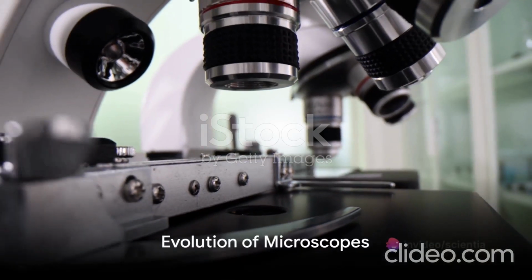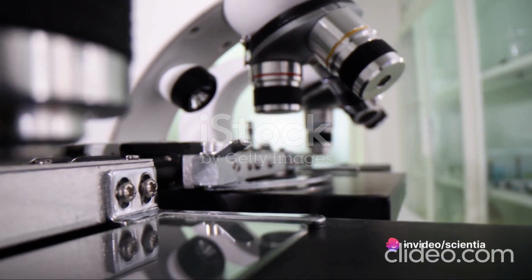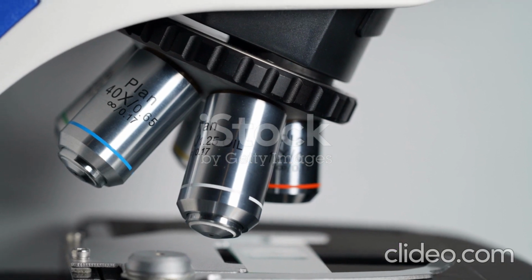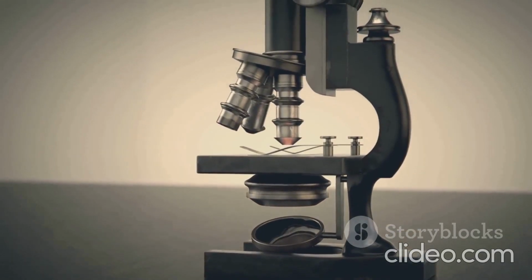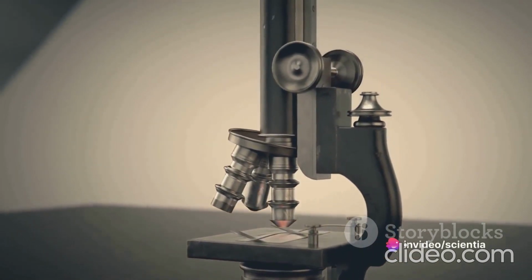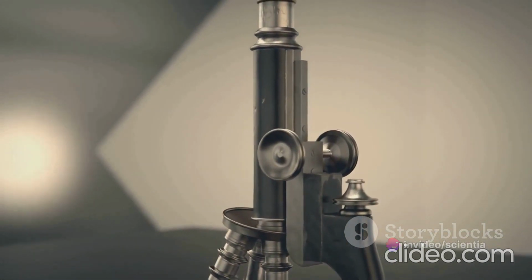Why do microscopes hold such a pivotal role in diagnostic laboratories? This might be a question that has crossed your mind. There's no denying the fact that these powerful tools have revolutionized the world of medicine and have become indispensable in diagnostic laboratories. The first microscope to be introduced was the light or optical microscope, invented in the 16th century.